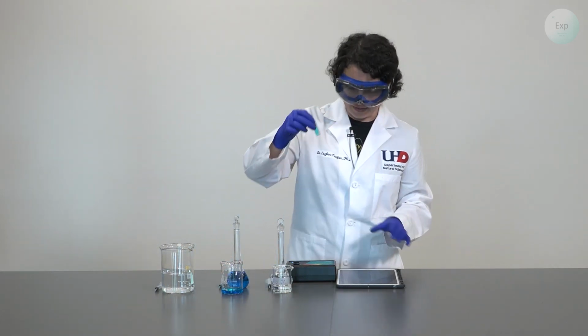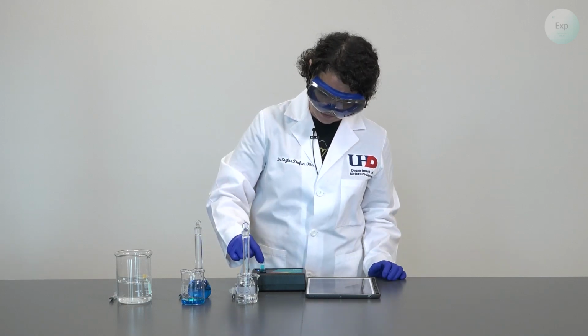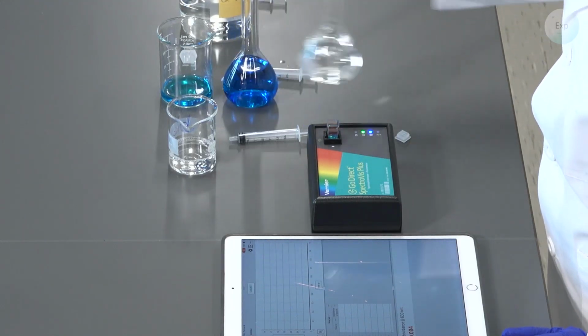At which point we're going to take our cuvette, place it inside the spectrometer with the clear windows pointing towards the white arrow and the white light bulb.